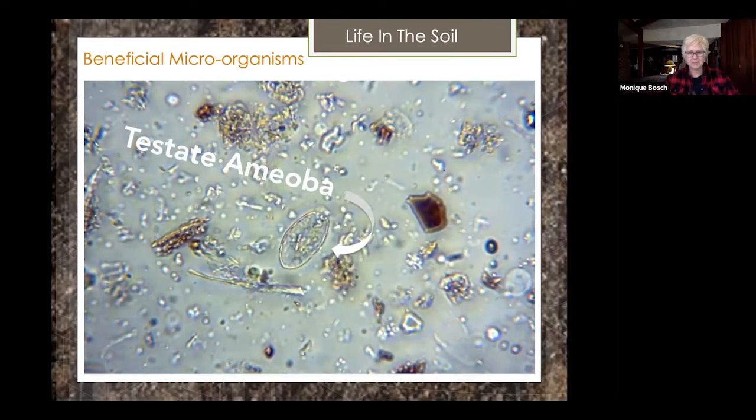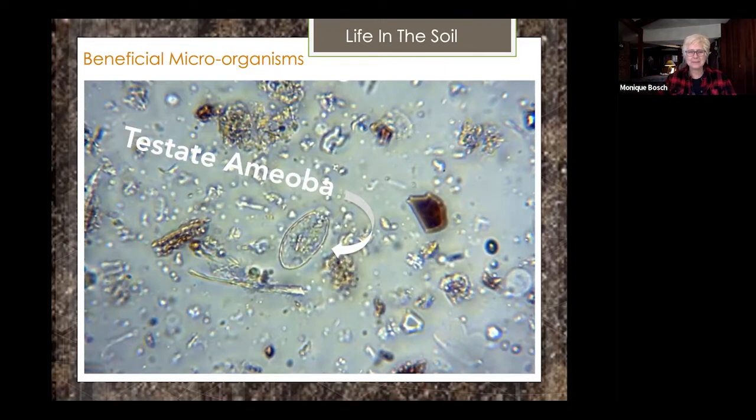Often when you find the most microbes, especially the predators, it's in a type of compost or worm castings. But this could easily come from soil. It's just they're less numerous, so you have to go through a lot more. But often with one drop of really high quality compost, you can find a lot of predators, as we're going to see here.